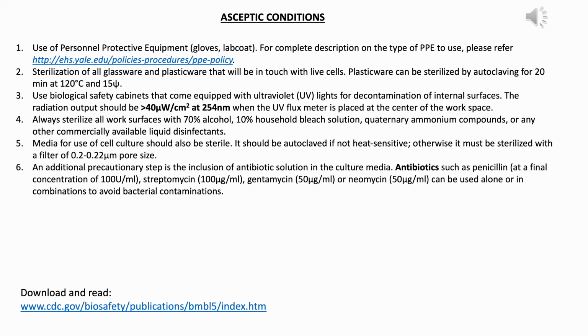And you also know if there are any flies or insects inside the biosafety cabinet, the UV light does not destroy them. So these insects can fly off once you open up the biosafety cabinet. But when they are inside, all the bacteria that are there under their belly and in the saliva are all very, very live. They are not destroyed by UV light at all. And once you turn on for your regular work, these bacteria are still around. Okay? So one should be careful that there are no insects inside the biosafety cabinet.